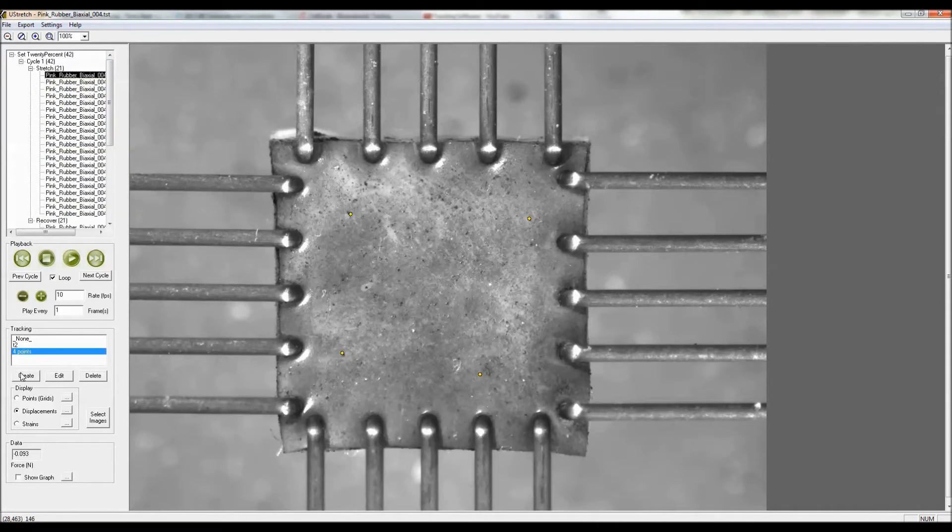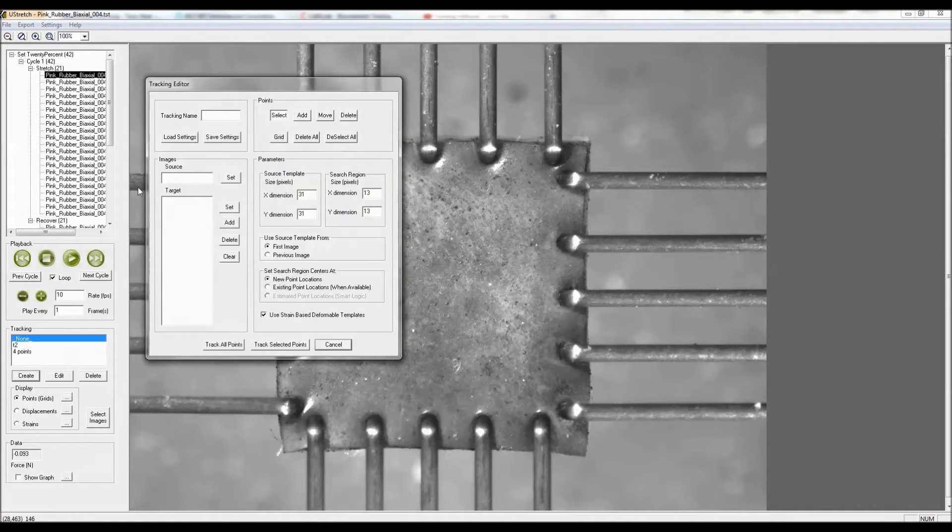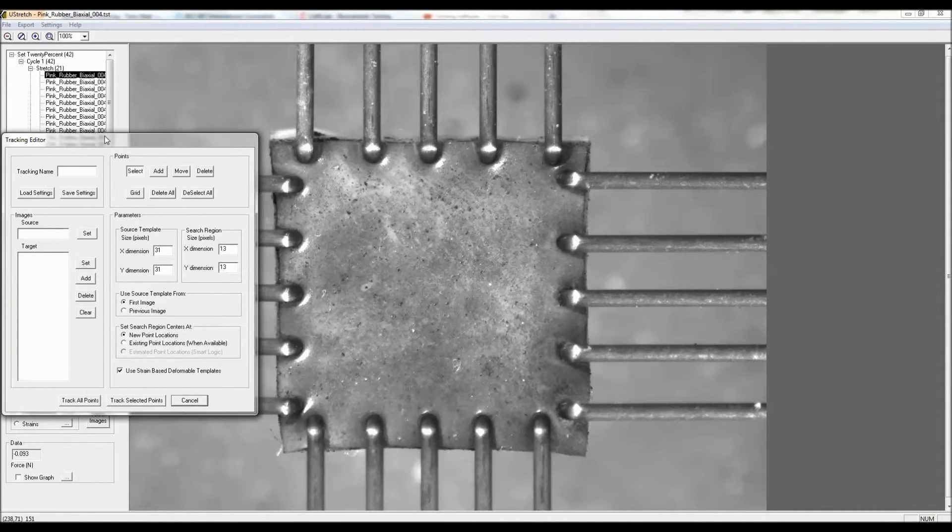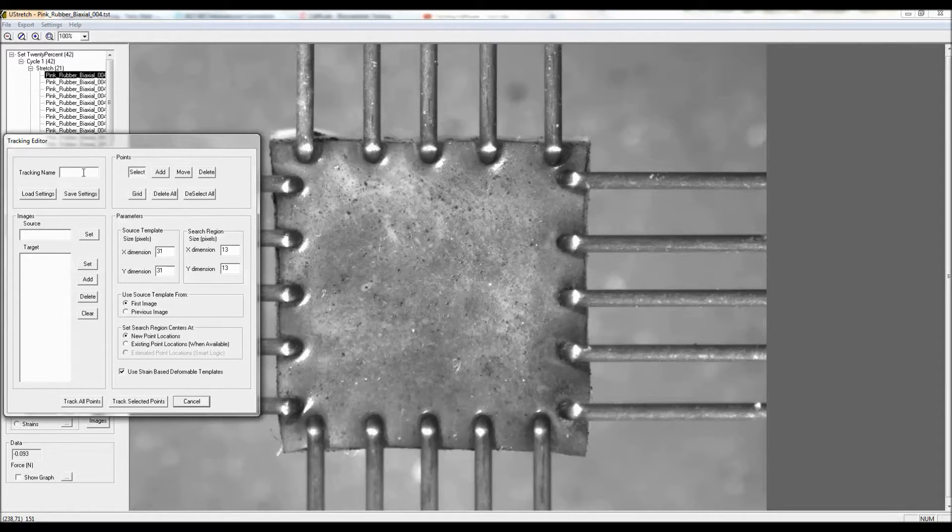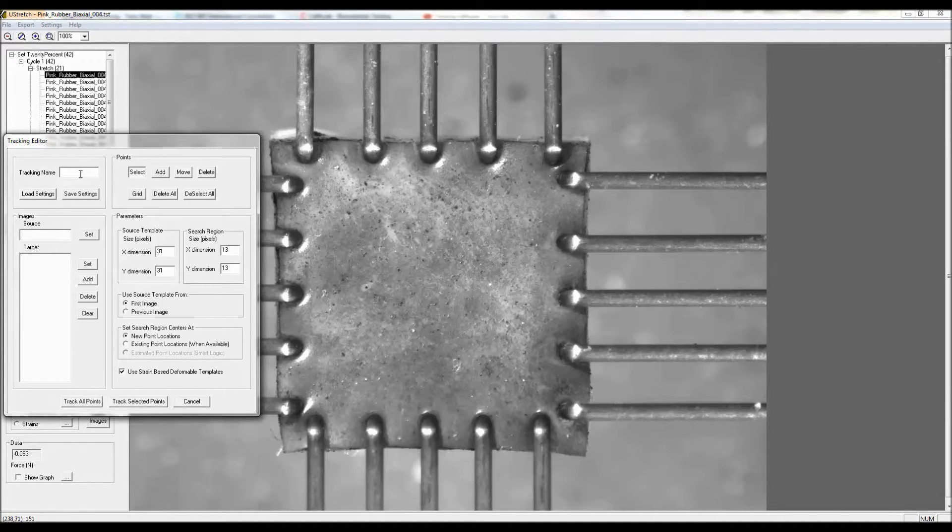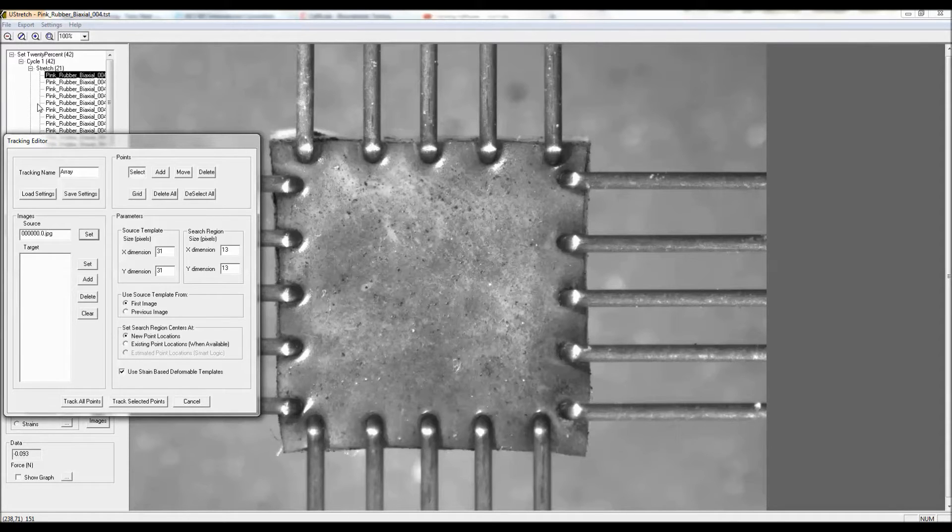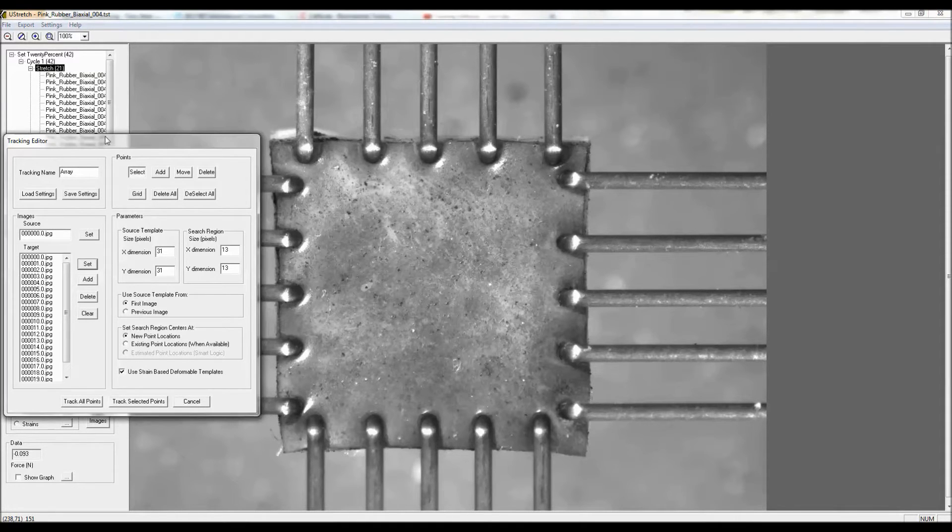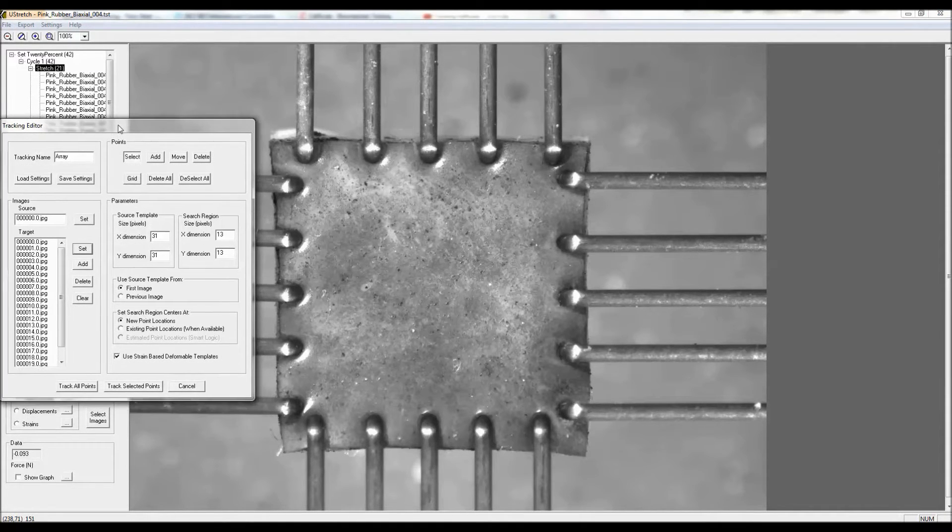Alternatively, what I could have done instead of tracking some individual points is to track the motion of an array of points. So I'm going to call this array, again from the very first unstretched image to the full series of 20 images.